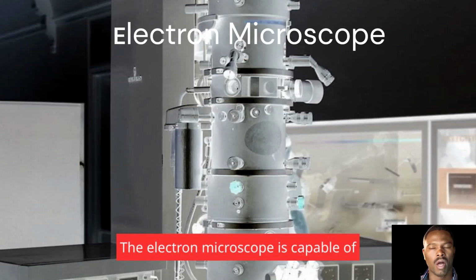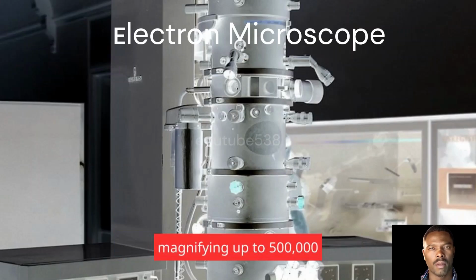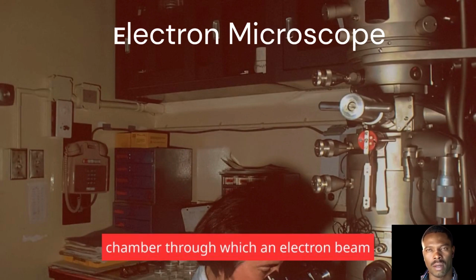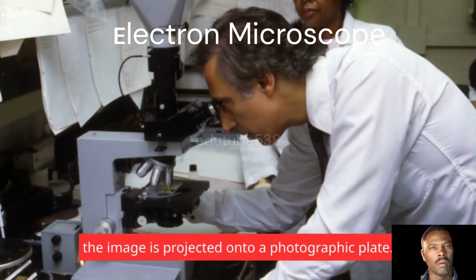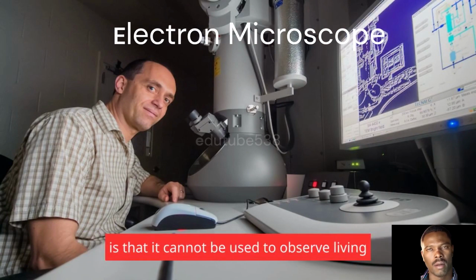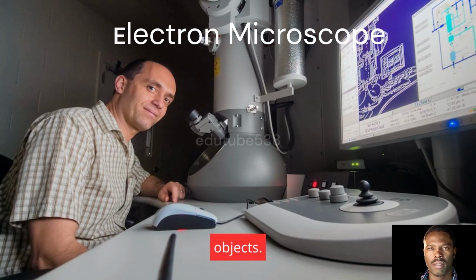The electron microscope is capable of magnifying up to 500,000 times. The specimen is mounted in a vacuum chamber through which an electron beam is directed. The image is projected onto a photographic plate. The major disadvantage of the electron microscope is that it cannot be used to observe living objects.